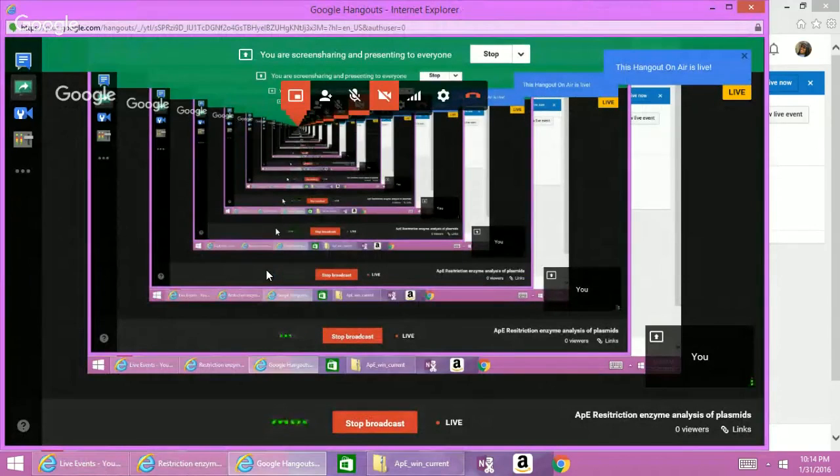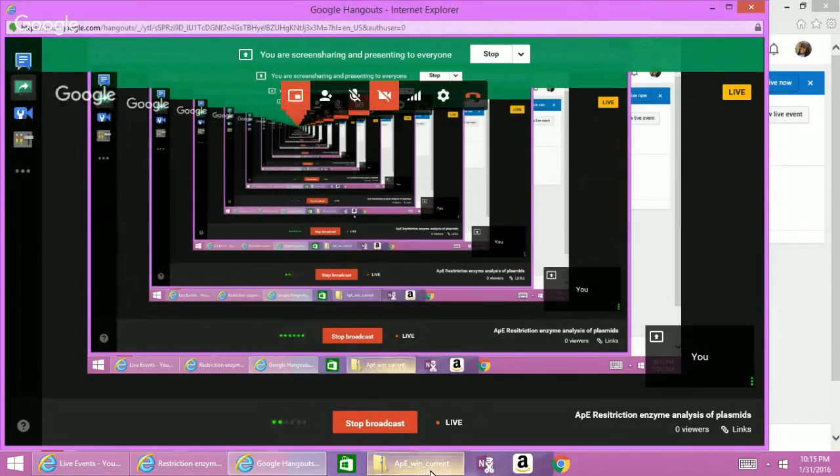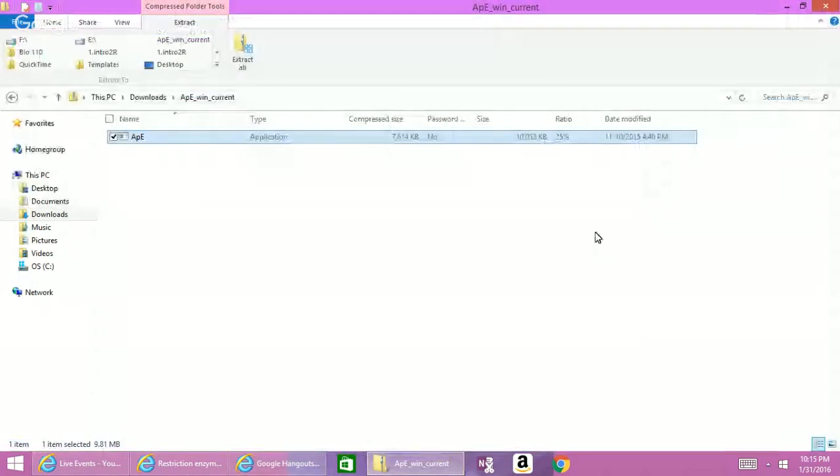Hi, in this presentation, I'm going to be running a restriction enzyme analysis on a plasmid using ApE software. Okay, let's get started. So first, I'm going to go to my ApE software, and I'm just going to click on it, and it should bring me to an open page. Waiting for it to open up.